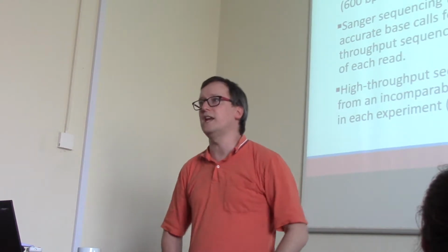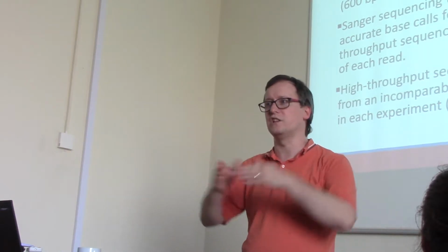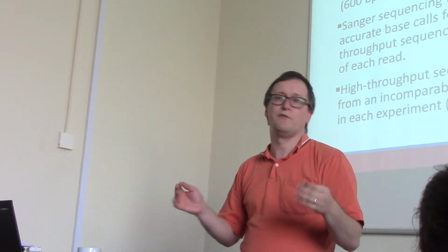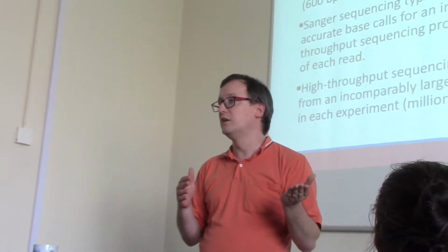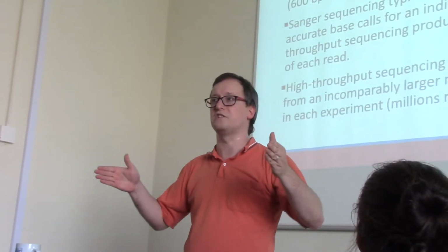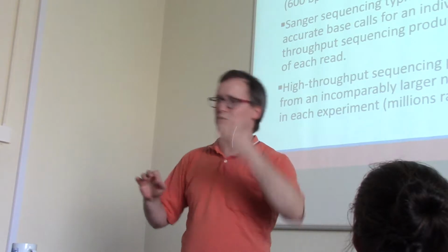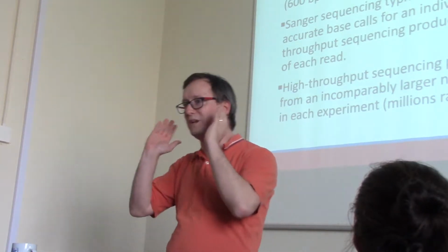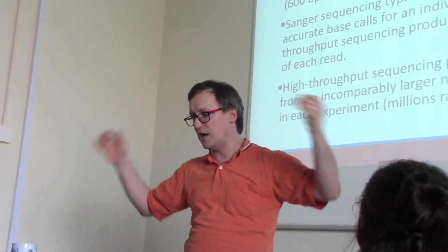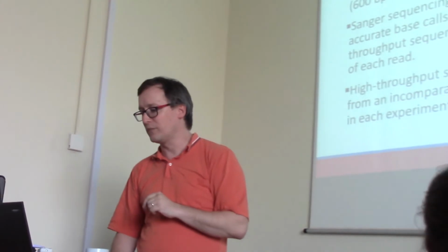And it's not even the case that the best sequencers are producing the longest reads either. For example, there's a relatively old machine called a MiSeq over at UWC, and the MiSeq produces longer sequences than the very expensive HiSeq X10s that we have in Beijing, knocking out genome after genome. So you're not necessarily going to see a correspondence between length and excellence of instrumentation or price of instrumentation.